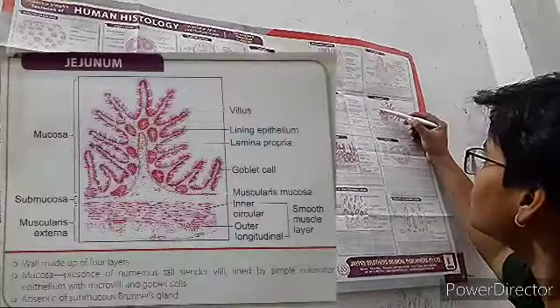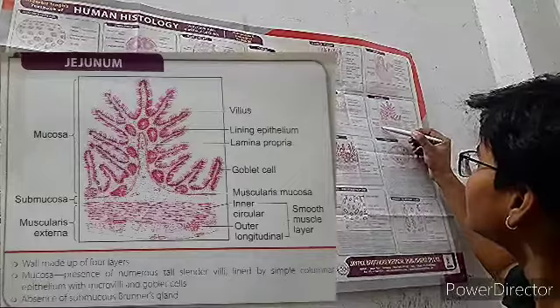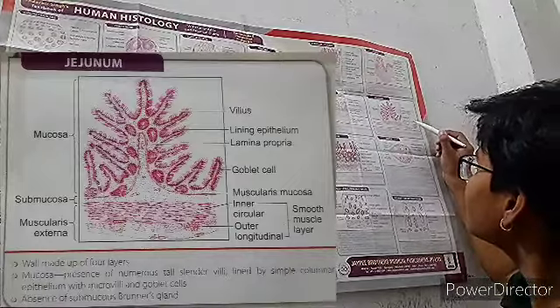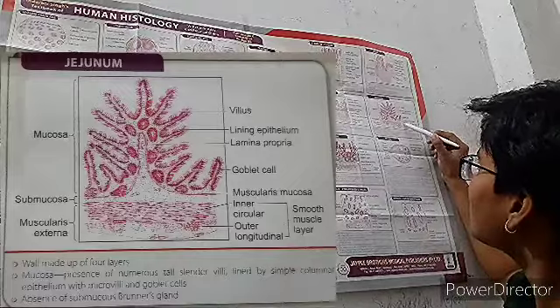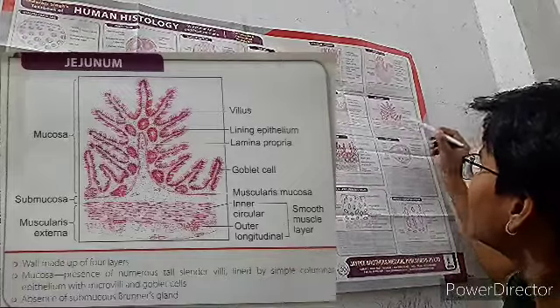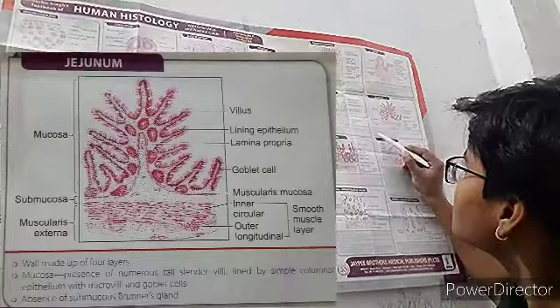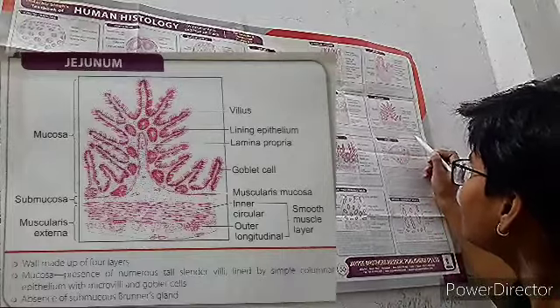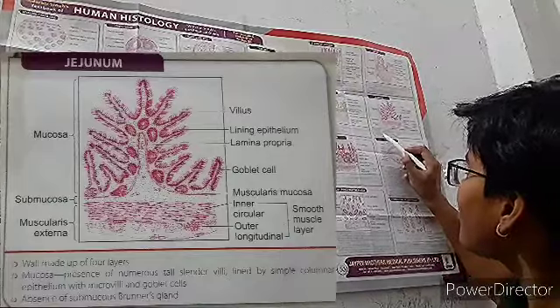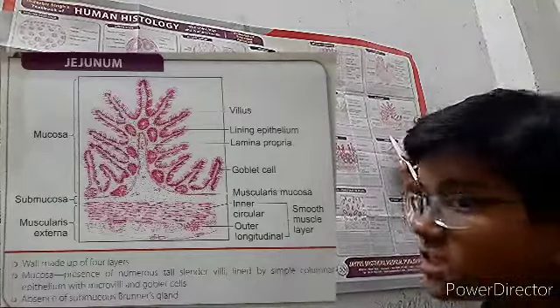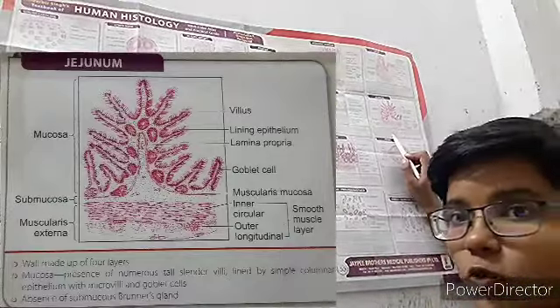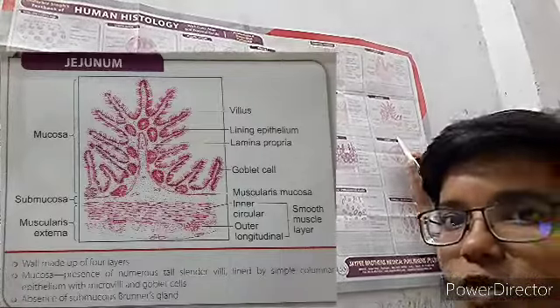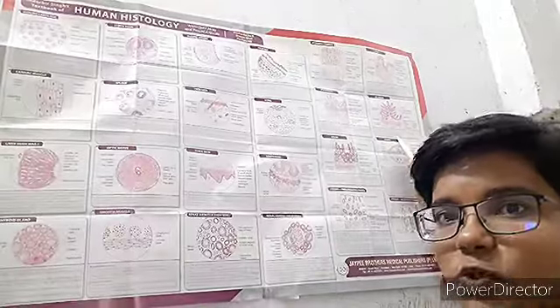Now the jejunum. Visible structures include mucosa, submucosa, muscularis externa, villi, lining epithelium, lamina propria, goblet cells, muscularis mucosae, and inner circular and outer longitudinal smooth muscle layers. The wall is made up of four layers. The mucosa has numerous tall finger-like villi lined by simple columnar epithelium with microvilli and goblet cells. Brunner's glands are absent in the jejunum.